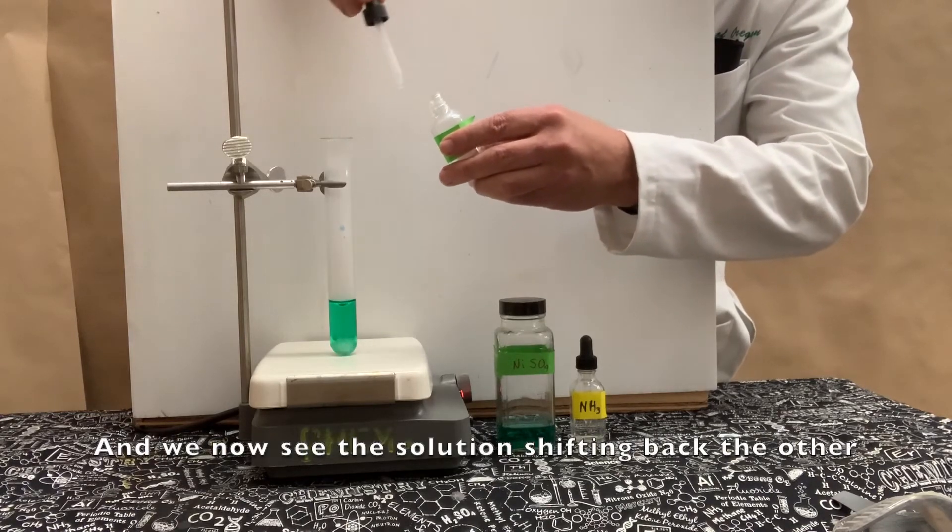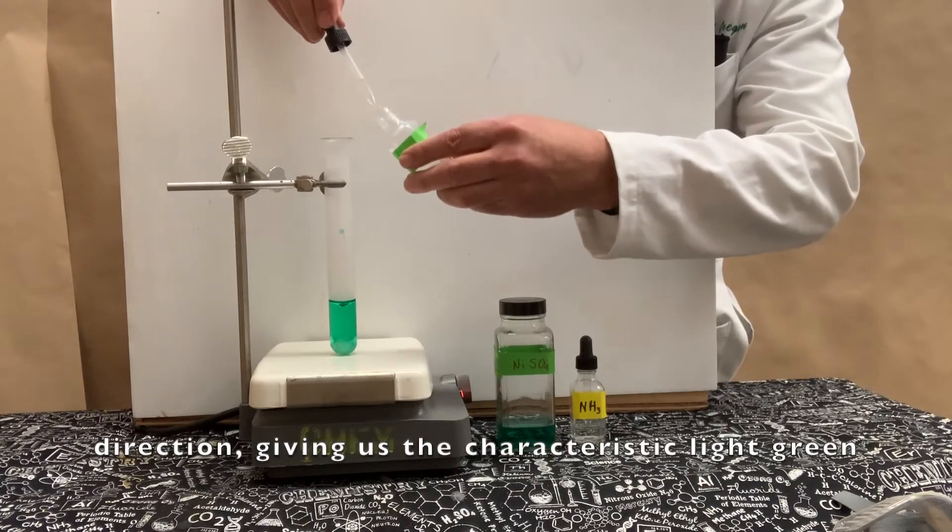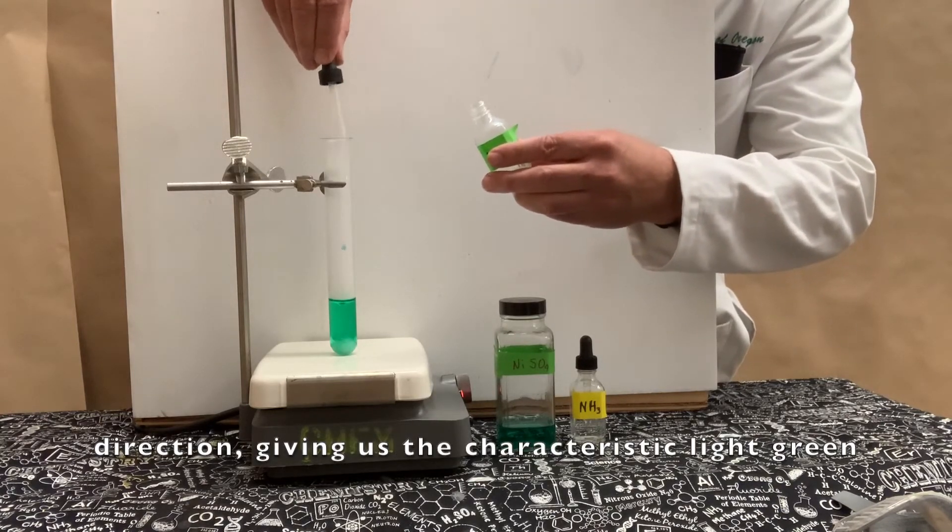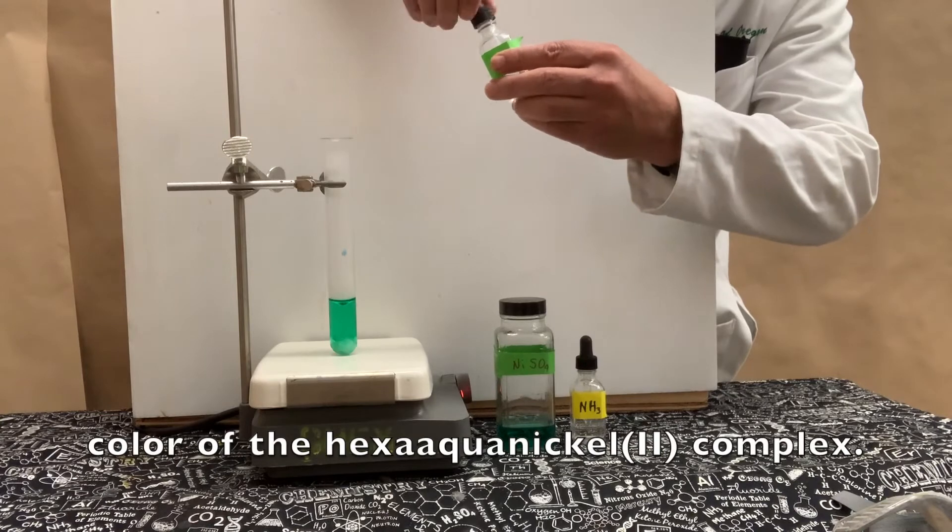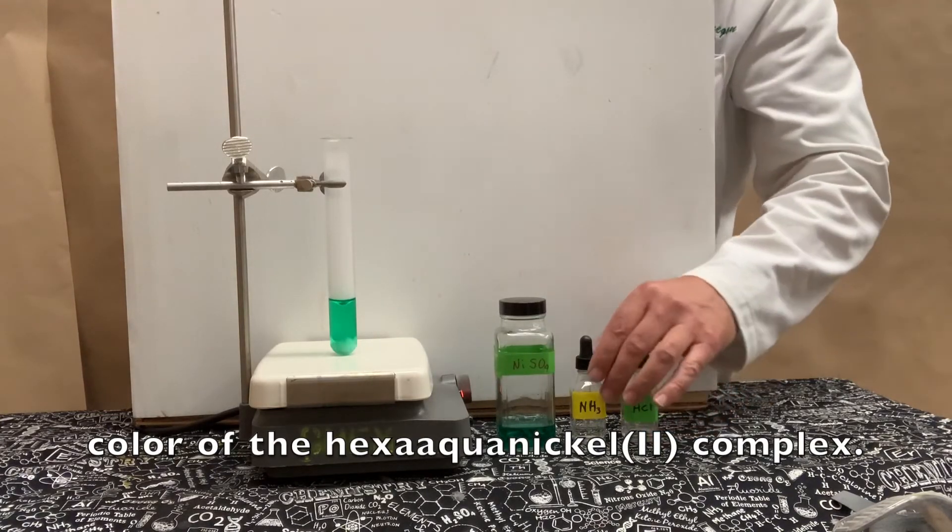And we now see the solution shifting back the other direction, giving us the characteristic light green color of the hexa-aqua nickel(II) complex.